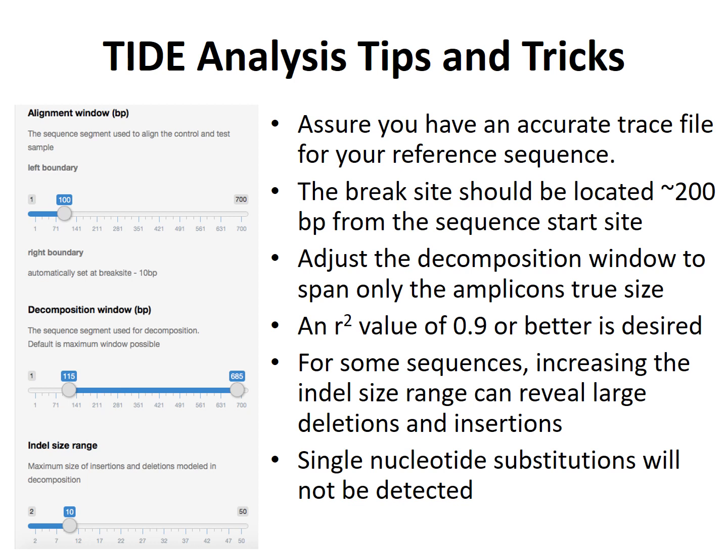And then finally, the indel size range. You can adjust this to different lengths to find sequences or indels that are bigger than 10 base pairs.